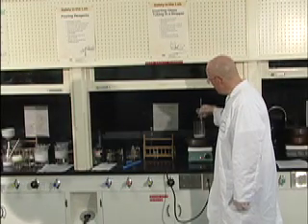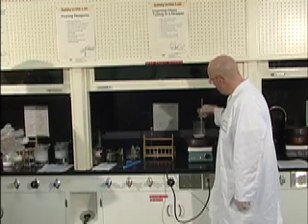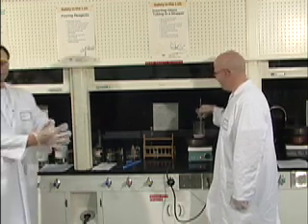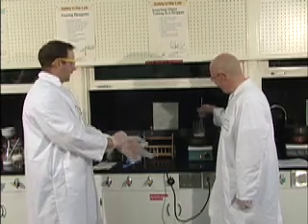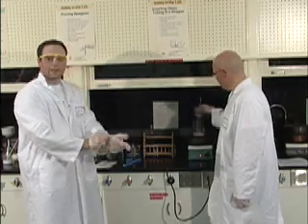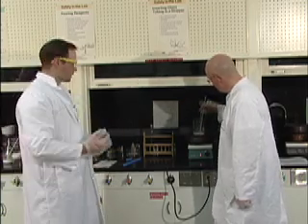How long is it going to take? Maybe 5 or 10 minutes. It'll heat up fairly quickly. I feel it's already getting very liquidy. Yes, it will. It'll become a miscible solution, which means it'll be infinitely miscible, as one. It'll mix together. Exactly. So it'll take about 5 or 10 minutes till it reaches 80 or 90 degrees.